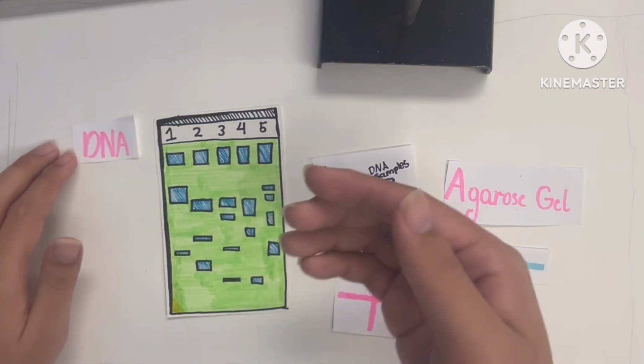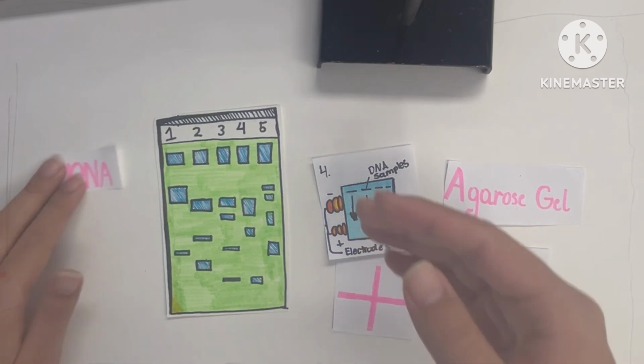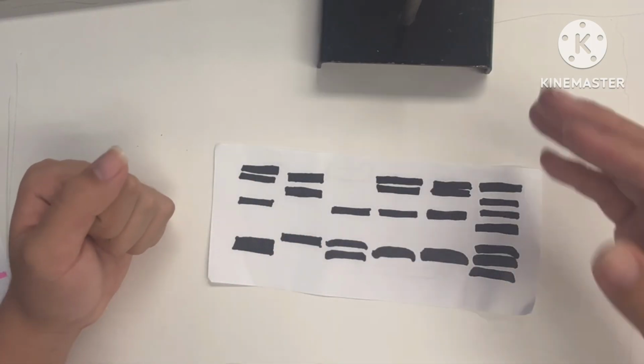As DNA moves toward the positively charged end, shorter strands move faster and vice versa. The stained DNA can be visualized as bands, with many bands running down the tray. From there, the results can be compared to match the DNA samples.